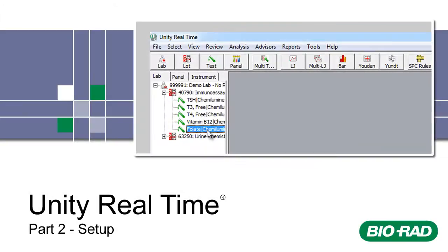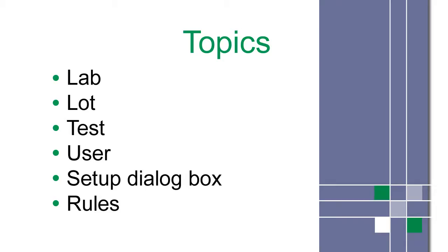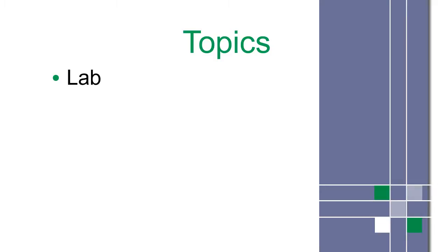Welcome to Unity Real Time Training, Part 2. This is a list of topics covered in this video. We'll begin with lab setup.